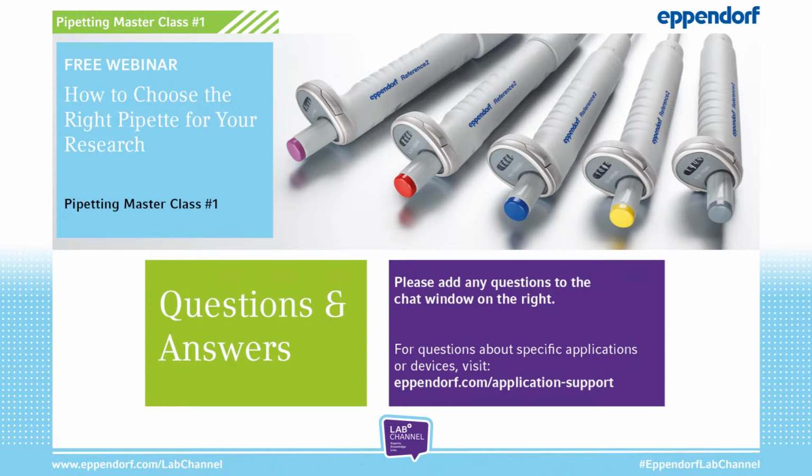We do have another question about reverse pipetting, actually. The question is if reverse pipetting increases accuracy when working with high viscosity liquids. Can you tell us more about that from the top of your head?